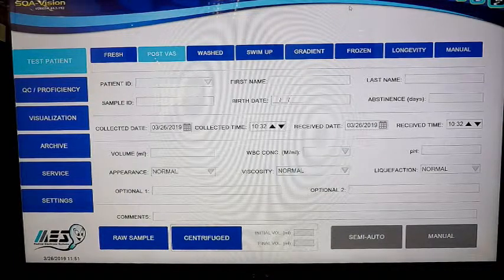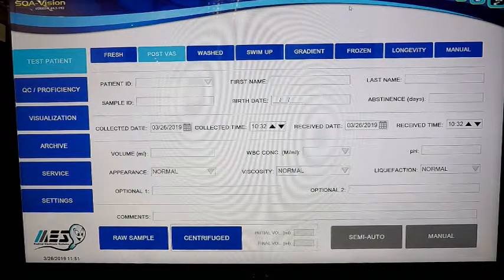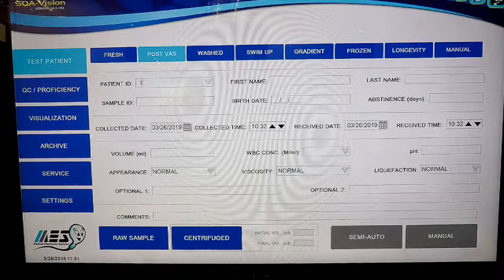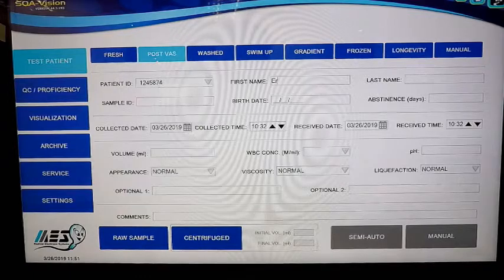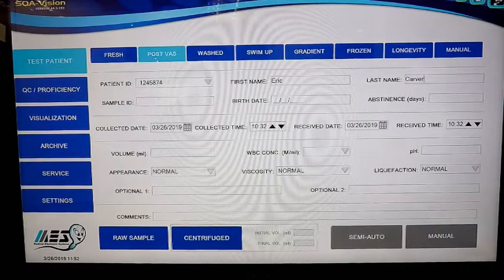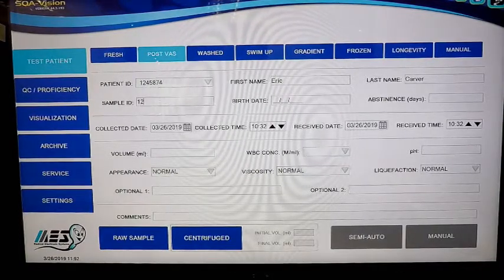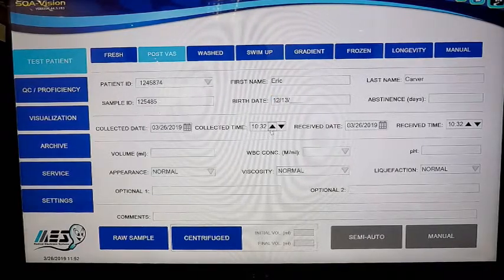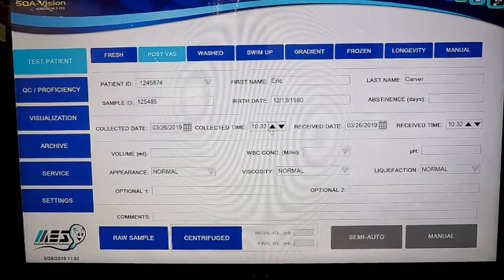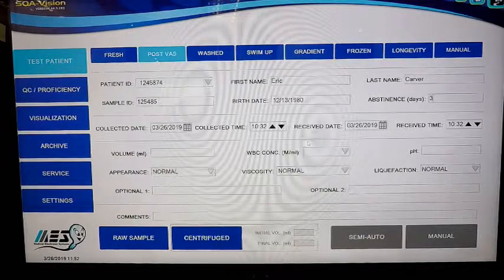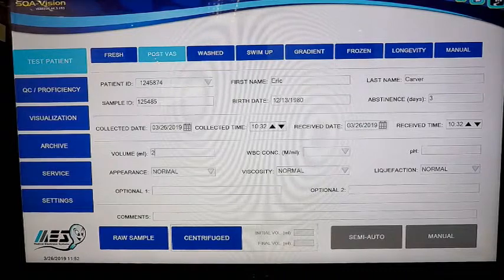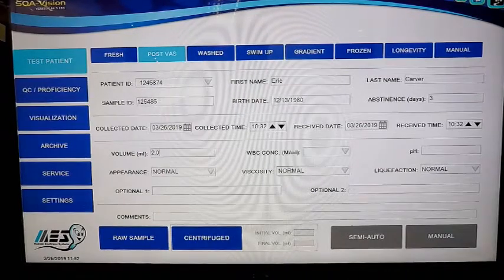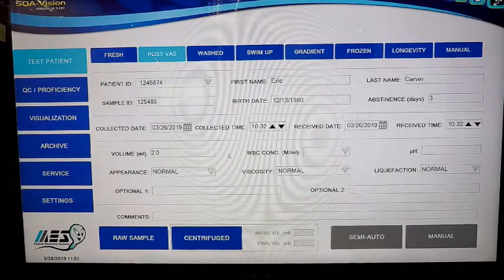Right here on the test now page under post-vas, this is standard across all sample types. You want to enter a patient ID, add a first name, a sample ID as necessary, patient's birth date if needed, days of abstinence, the date and time the sample was collected and received, and sample volume. This will be important so you can get totals for the entire volume. You'll know the number of motile and immotile sperm for the entire ejaculate by the time you're done with the test.